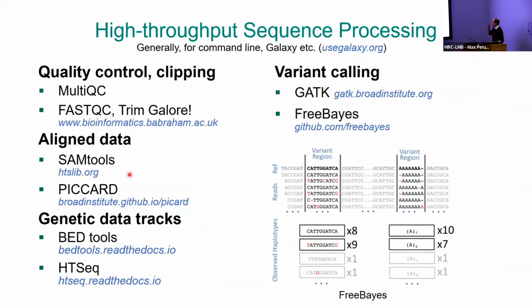I'll just talk briefly about some of the tools that are involved. They sound a little bit esoteric at first, but if you know what they do, then they're not really too complicated, or at least you have a broad idea of what they do. FastQC gives you a global overview of how your sequencing went. It's a quality control tool essentially. Does the data look as I expect, have I got the right number of reads, are they of the right quality?